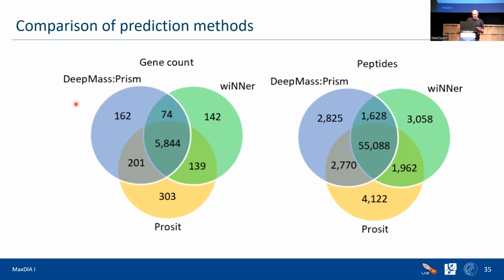So nothing special about it, lots of data in PRIDE, or Krista has done a lot. And so on this, you can build these models. But if you now are in a special situation, let's say you have special modification, special mass spec hardware, other fragmentation techniques. So if anything is already a little bit different than what the mainstream is doing, you have a problem, right? Because that's not what the machine learning model was trained on.